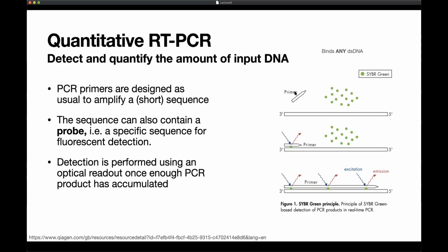And then the primer hybridizes, and then you start elongation. So now you have double-stranded DNA. SYBR Green, if it's bound to double-stranded DNA, and if you shine the right wavelength of light at it, will emit a detectable fluorescence, which you can then read off with a different detector, so blue in, red out. And as you synthesize more and more molecules, double-stranded DNA is the presence of a successful hybridization.